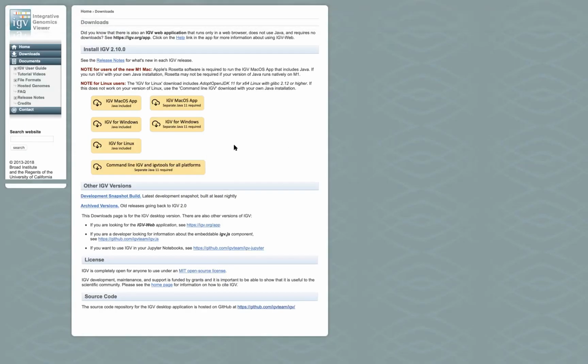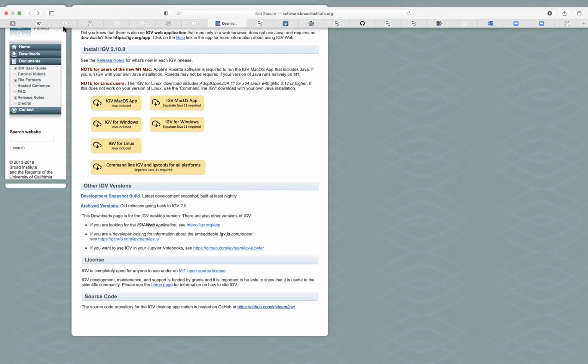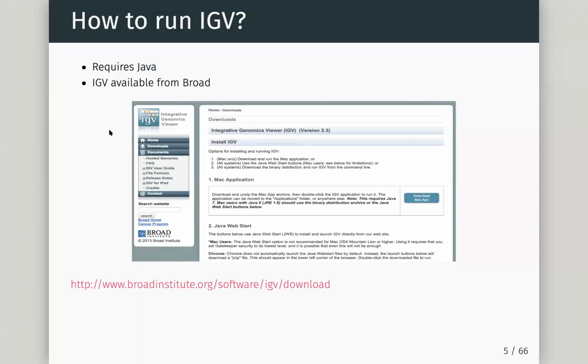As far as I'm concerned, that hasn't ever happened. The only thing is that we have some software which uses features of IGV. Maybe these change or the way to interact with them changed, and that kind of broke. If you want to get IGV though, the major way is just to click here and it will download both Java, which is the dependency for IGV, and IGV, and you should be just good to go. If we have problems, I'm going to be around at the end and we can work through installing it.